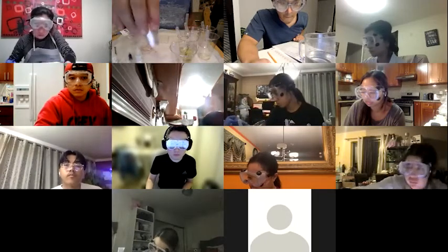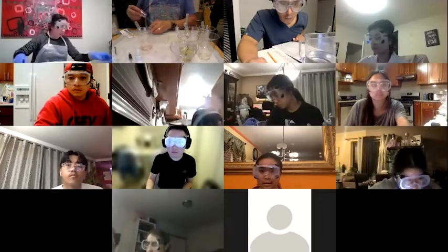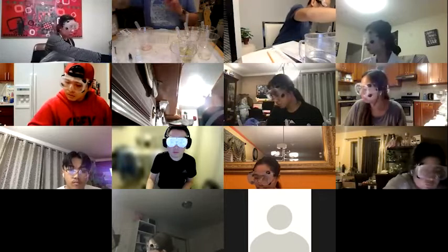Then we'll be using these 3 little cups for our dilutions. So I should label these dilution 1, dilution 2, dilution 3.